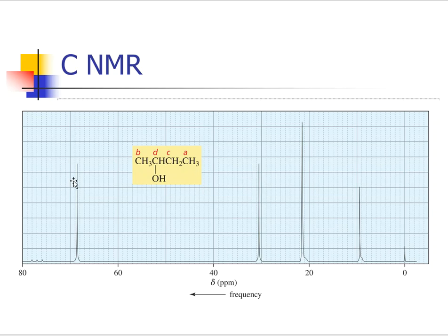And we don't really go through this idea of splitting and those types of things, right? Notice that here with carbon A, well, it's got a next door neighbor, and that's 1 carbon that's next door to it. And I don't really have to go into the splitting concept. And if I look at the signal, it is 1 line pretty much that goes straight up and straight down.